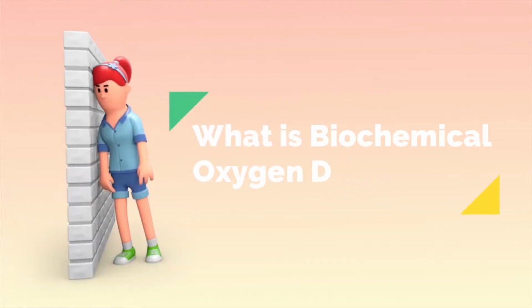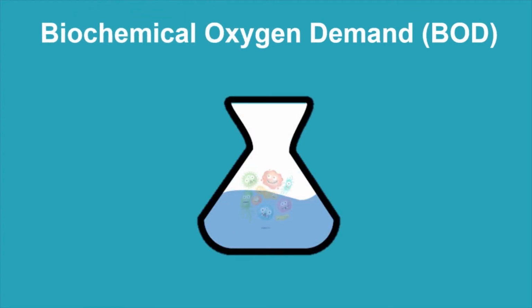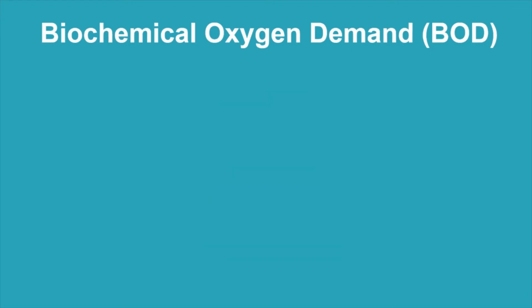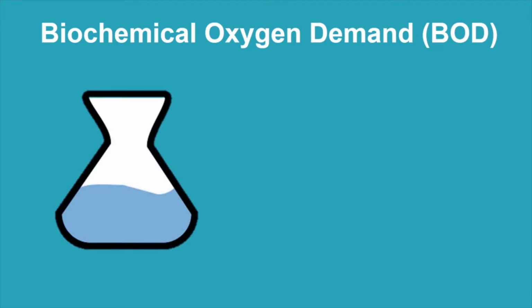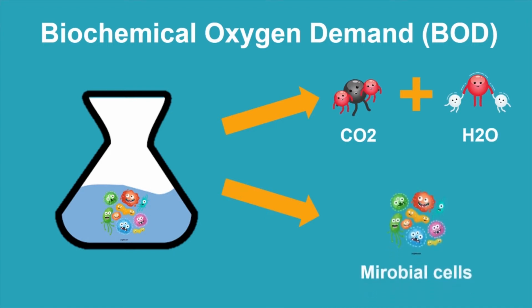Do you know what is biochemical oxygen demand? Biochemical oxygen demand (BOD) is the amount of oxygen utilized by microorganisms to decompose the organic compounds in a water sample under aerobic conditions over a specific period of time. Under aerobic conditions, the microorganisms will oxidize about 1/3 of the dissolved organic compounds to CO2 and H2O, whereas the remaining 2/3 will be converted to new microbial cells.